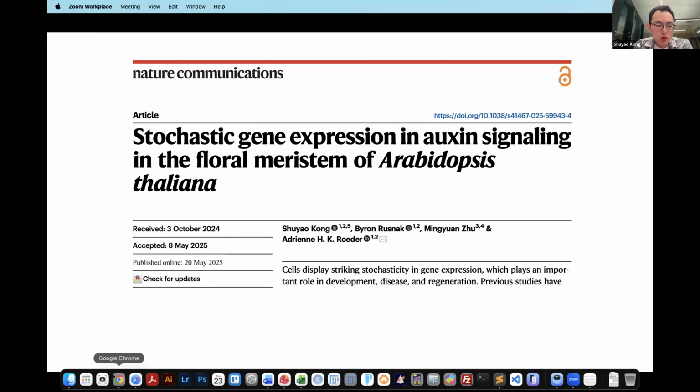That's indeed very insightful. If you think that even within the same plant or within the same inflorescence there are going to be differences between samples, you can image all of them, and then you can quantify them in MorphoGraphX.